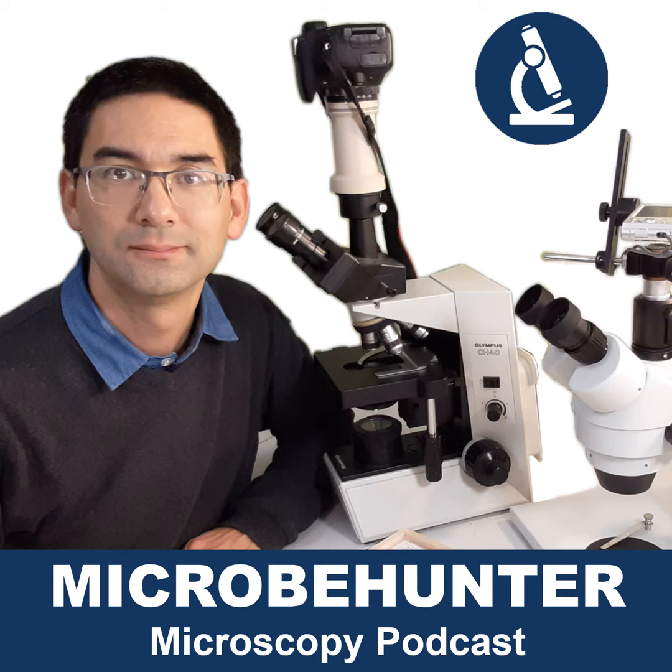So what's the take-home message? The take-home message is: go microscope shopping, and don't worry too much about the maximum magnification, because it covers the whole range already, and look for other factors that you want to have. For example, are you able to attach a camera to the microscope? I think it's much more important, for me at least, than to have a very, very high magnification, which I'm not using anyway. Are you able to attach a camera to it?